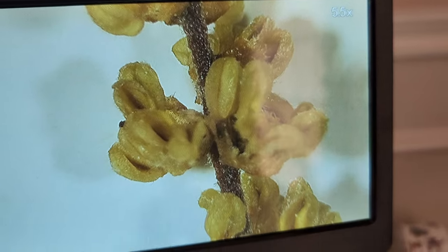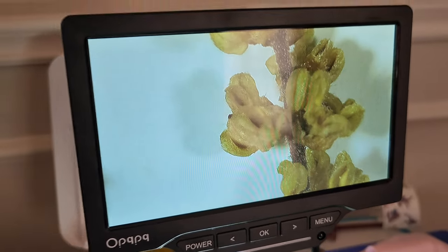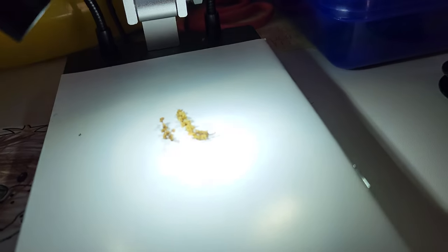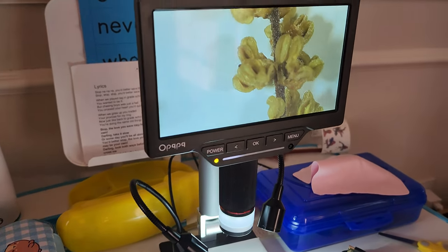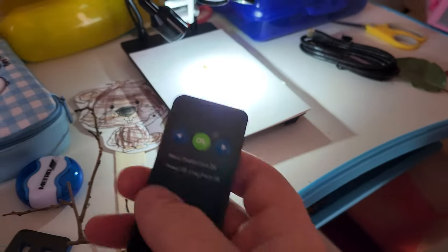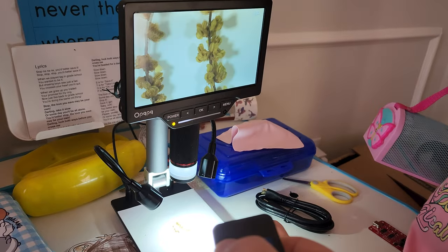So I've got 5.5x — we're at 5.5x digital zoom. That is that tiny little pollen sack right there. That's tiny. I didn't realize that the remote that comes with the microscope has got a zoom feature using the arrows.